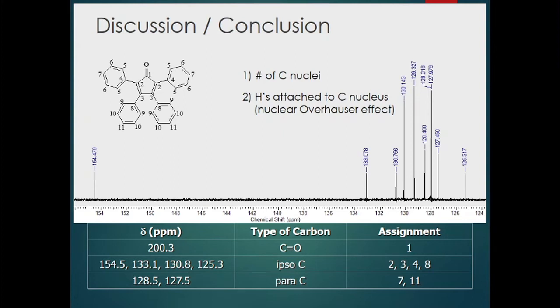Again, if one peak is twice the size of another, it means there are twice as many carbons. And so you would do the same analysis that we just went through, doing that with the spectrum, and then seeing how it correlates with the structure. I will add one bit of information. Carbon NMR, because we're looking at a fairly broad range, 200 parts per million, and all of the peaks are singlets, it is rare that we have overlapping peaks.